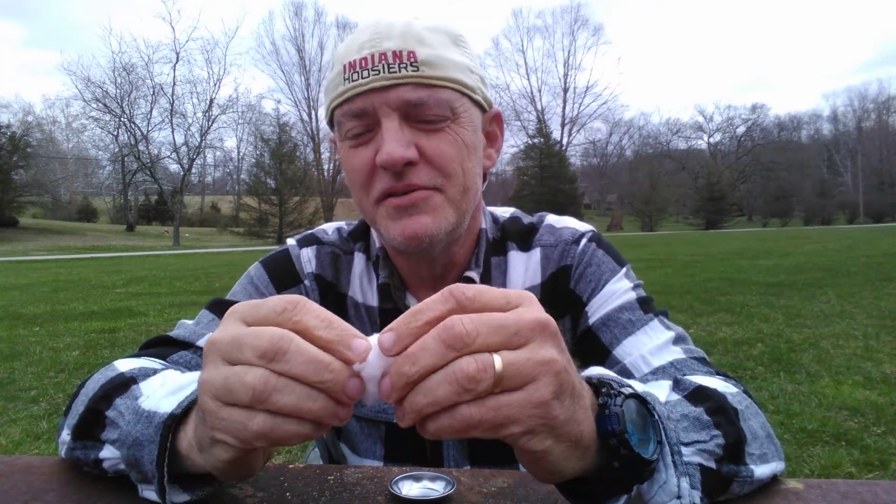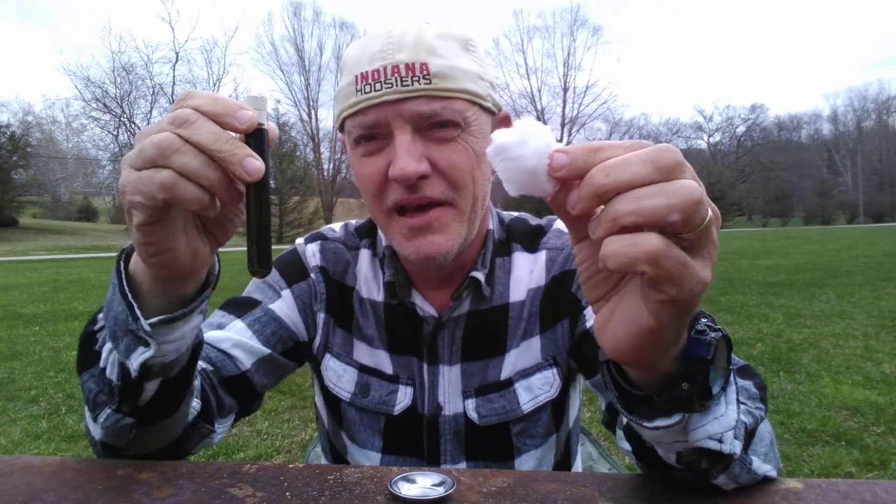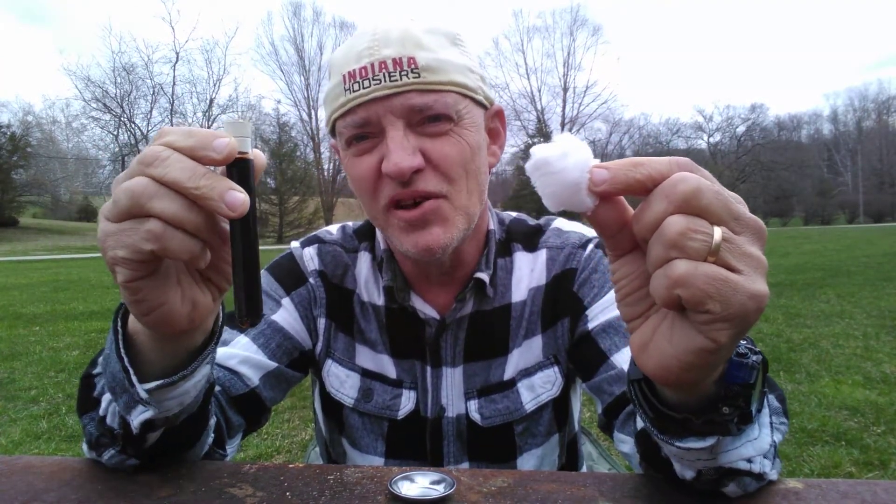Hi, today we're going to be doing a science experiment to test the chemical reaction between cotton and hydrogen sulfate.